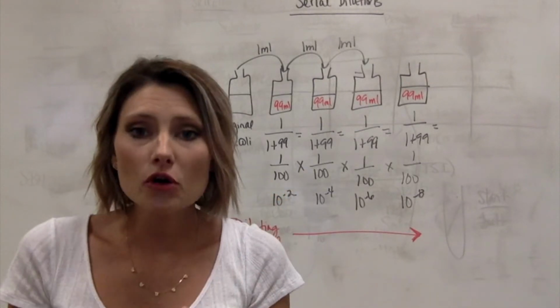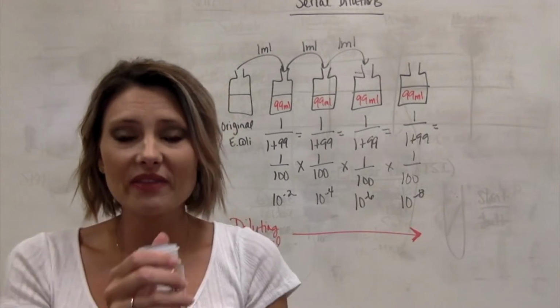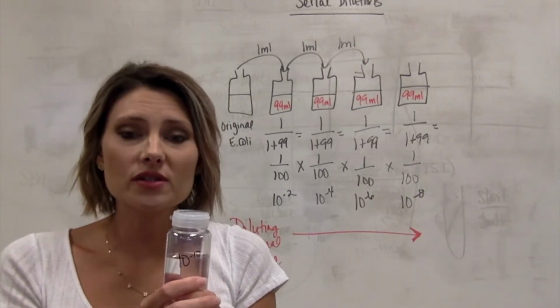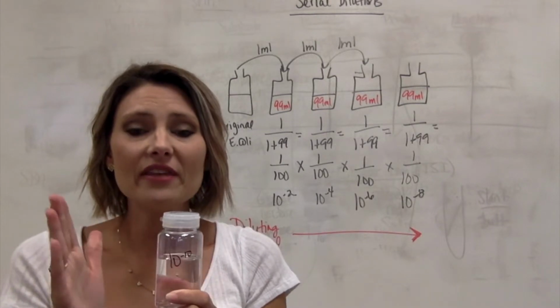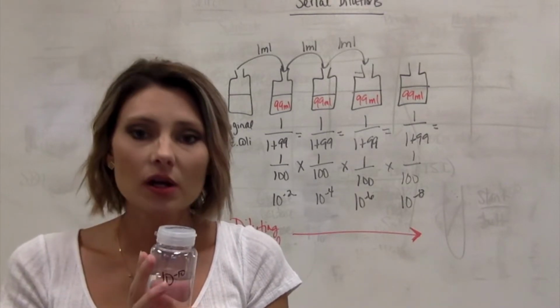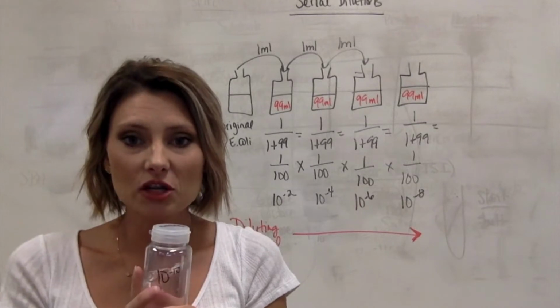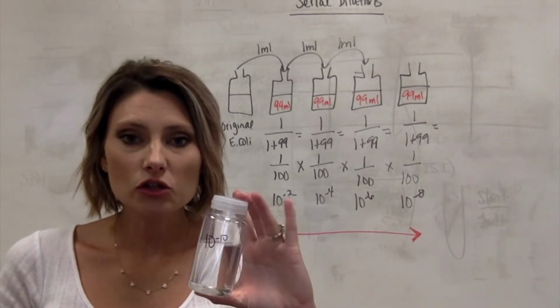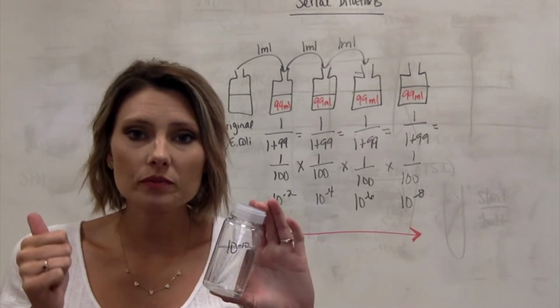Now, we also can make them in the lab, and they're put in what are called prescription bottles. So it's just 100 ml bottles. And then we put the same buffer that's in here, and then we autoclave them to make sure that they're sterile and that there's nothing in them. So we need dilution blanks. We need our original sample.